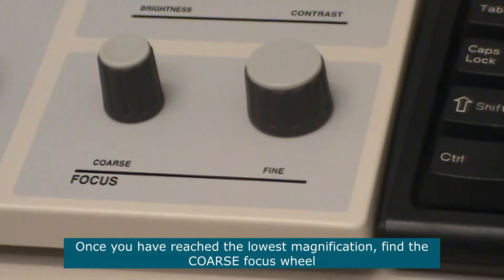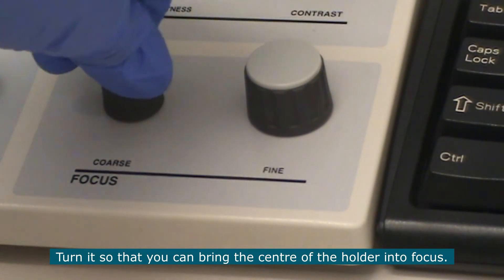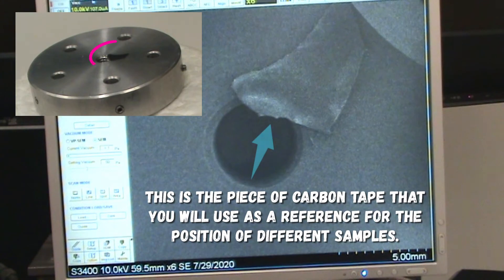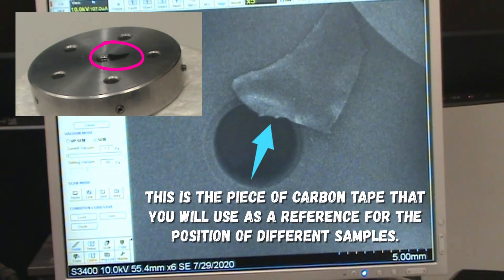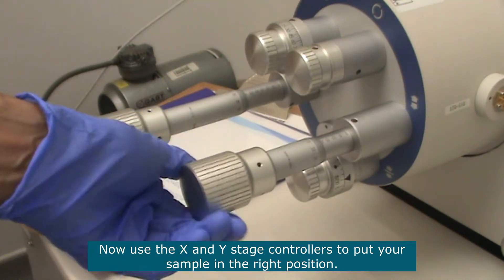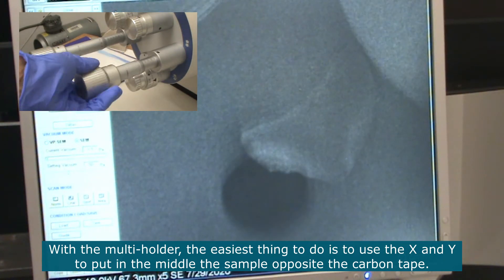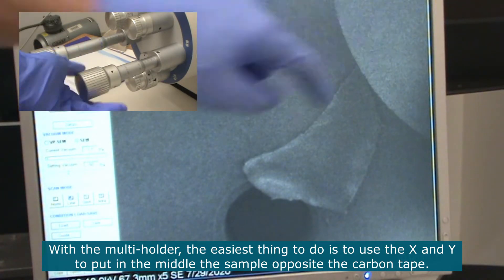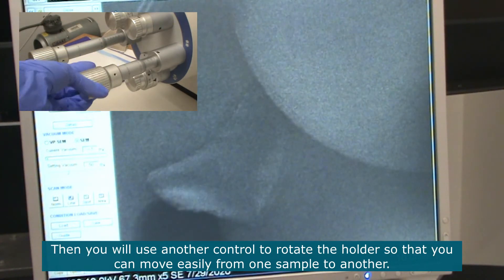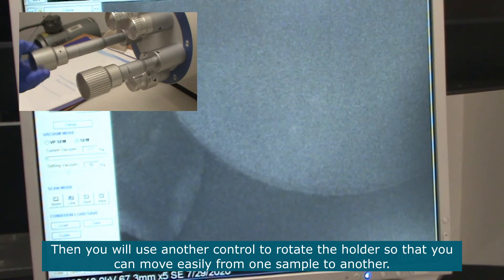Once you've reached a lower magnification, go to the coarse focus wheel and turn it to bring your image of the center of the holder into focus. Then use the X and Y stage controllers to put your sample in the right position. With the multi holder, the easiest thing is often to place the sample directly opposite to the carbon tape in the middle, and there is another control that will allow you to rotate the holder to move easily from one sample to another.